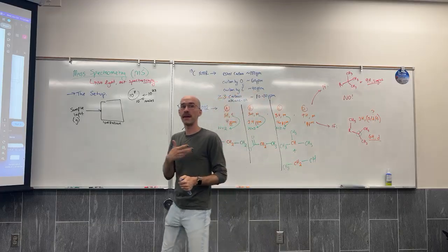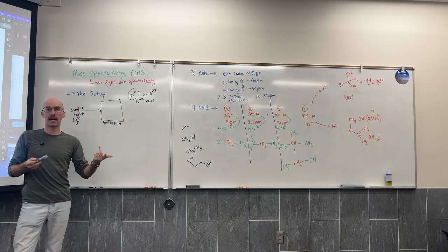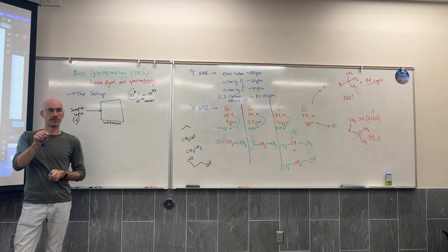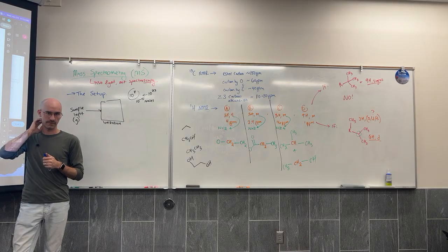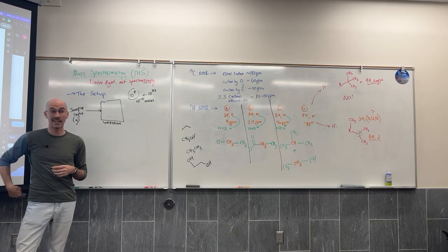It is hard to add protons, unless, of course, I'm literally adding hydrogen ions, which are just protons. What we're going to do here is electrons. We're going to actually pull out electrons. So our ionization chamber takes our neutral molecules and ionizes them by removing an electron. How do you remove an electron from a molecule? We will use an electron beam.